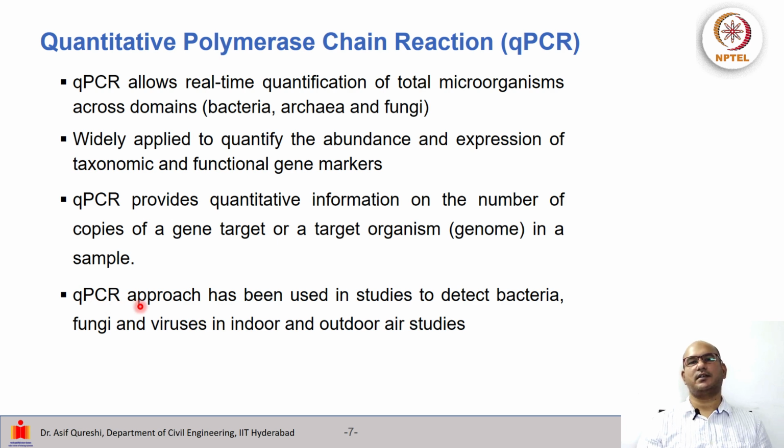Often qPCR has been used in studies to detect bacteria, fungi and viruses in several indoor and outdoor air characterization studies.